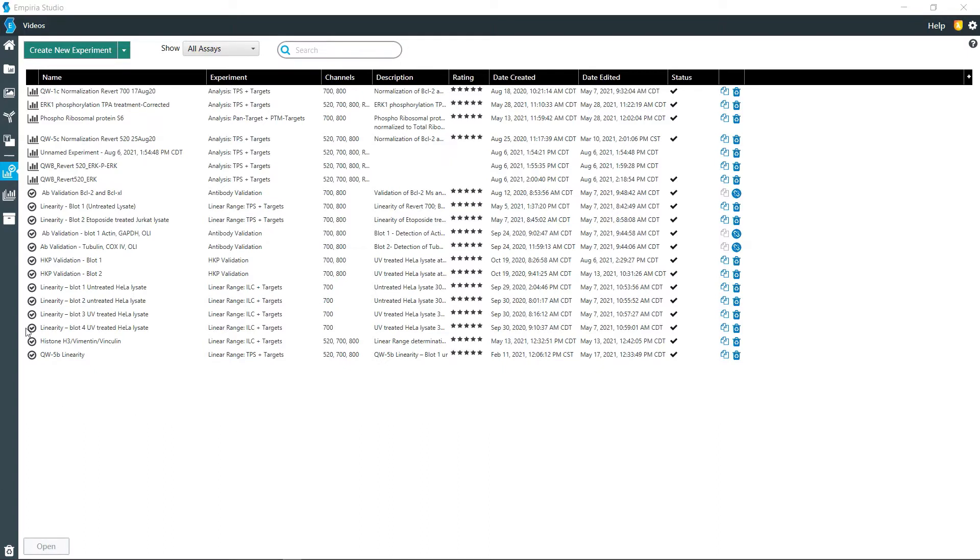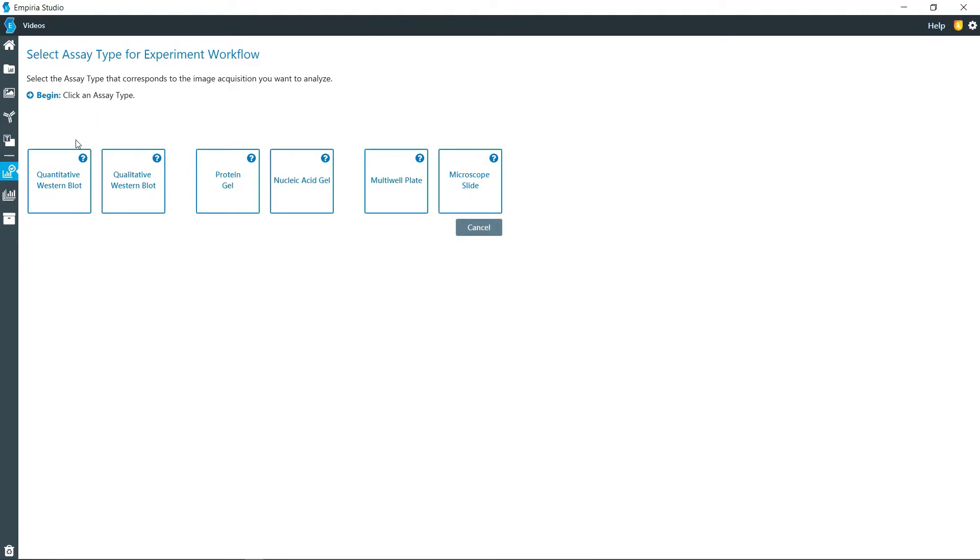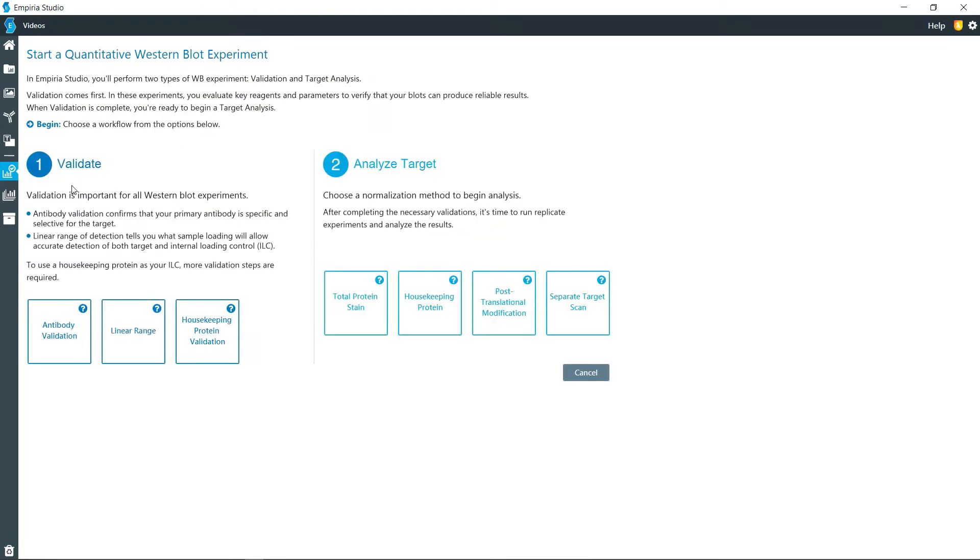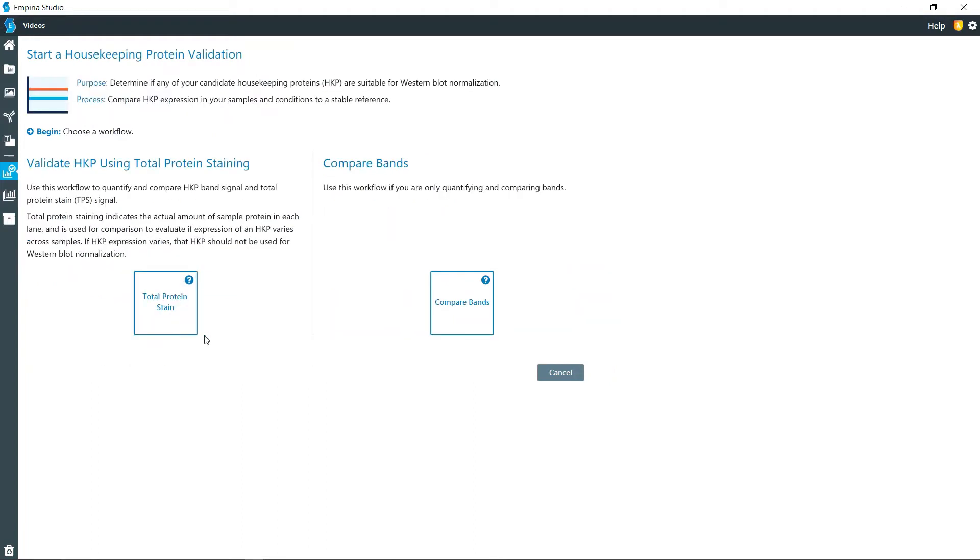I'm going to click on create new experiments in a project that we already have open, and then under quantitative Western blot, I'm going to click on housekeeping protein validation.